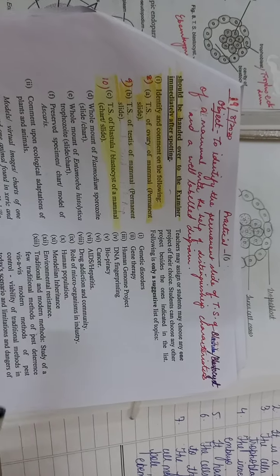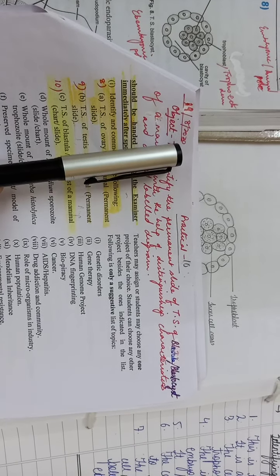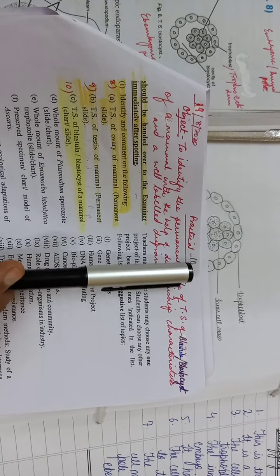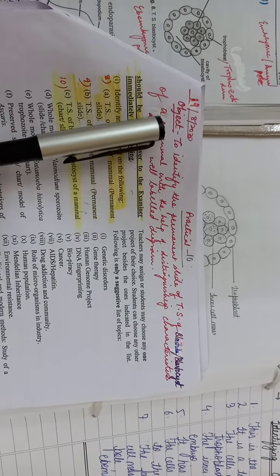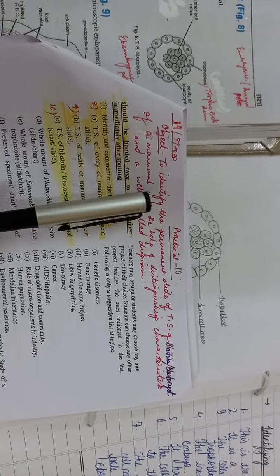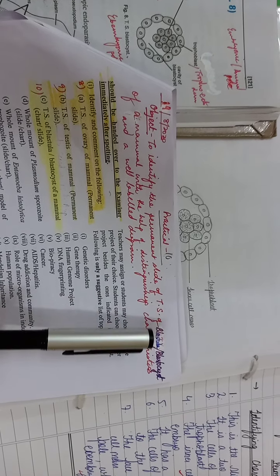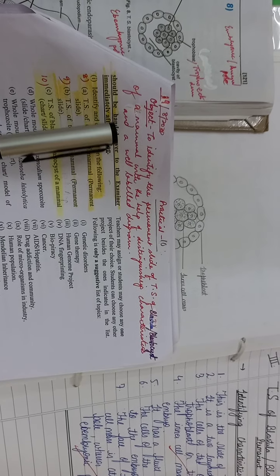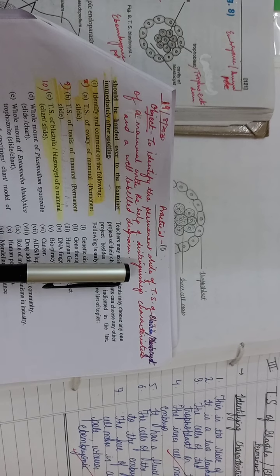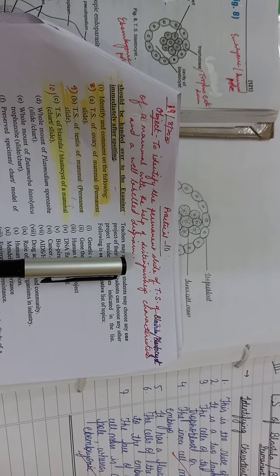So on a new sheet, you will write down today's date, 19th of August 2020, and the practical number in pencil, because this will change later. Then the object: to identify the permanent slide of TS of blastula or blastocyst of a mammal with the help of distinguishing characteristics and a well labeled diagram.